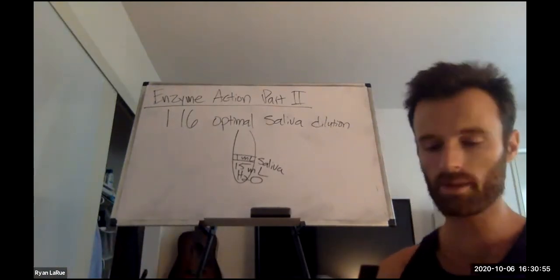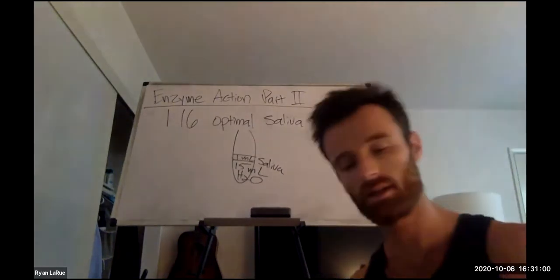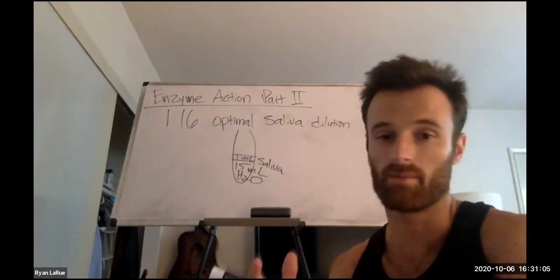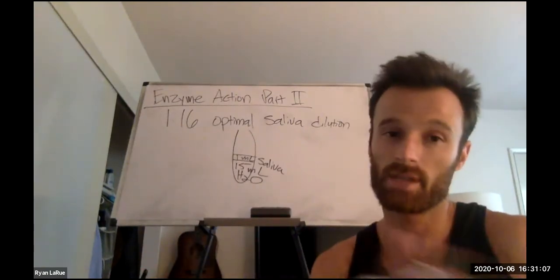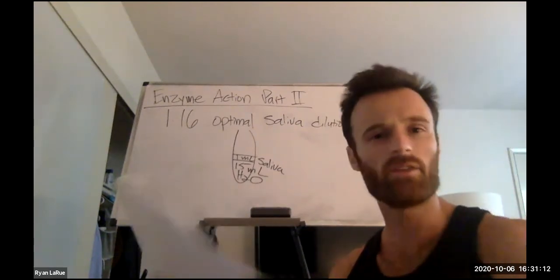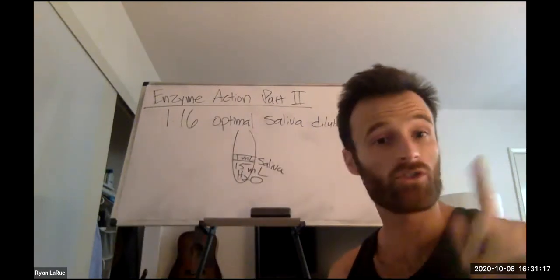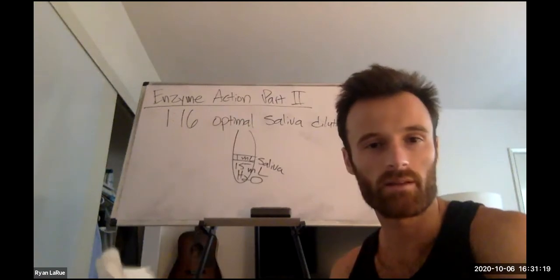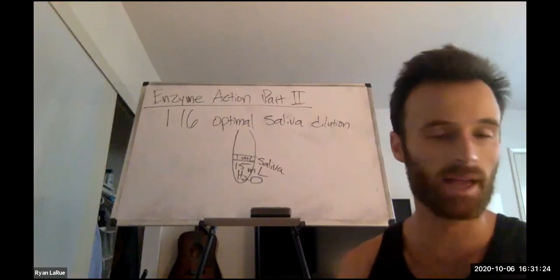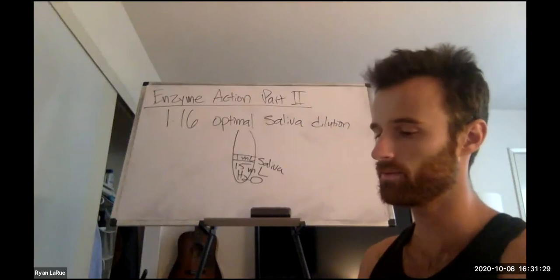So what I'm going to do for this lab, since we're not in person, usually I'd assign lab groups a different factor to test. I'd assign a couple groups pH, I'd assign a couple groups temperature to do and test throughout the lab. I'm going to let you guys choose. I'm not going to assign it. Just choose one you want to learn about and look at. And Stacy has pictures of data and things for each one in the lab.